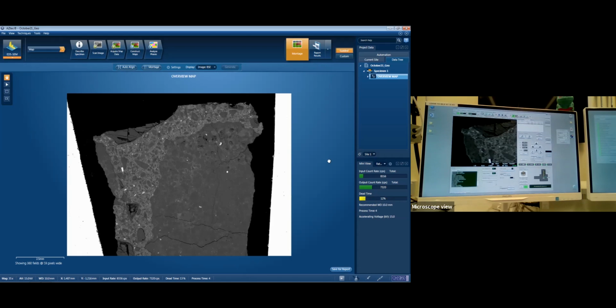Before we get started, just to give a little bit of context, this rock is from a mine in South Africa called Kimberley Mine, which is quite famously known for being a big diamond mine. I haven't actually found any diamonds in this, which are just made up of carbon. So if we find any carbon in there, we might have found a diamond, which might be very exciting. Keep an eye out for that, because we would like to find some if we can. That would be cool. That's our main goal. If we can find diamonds, that would be cool. Would be nice.